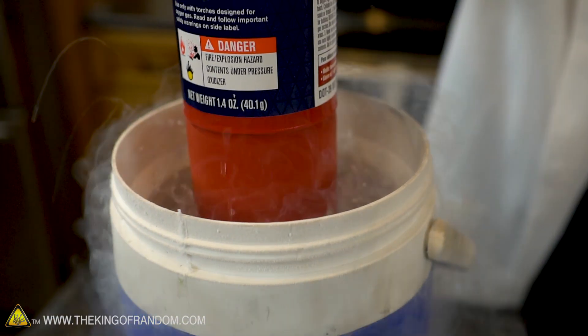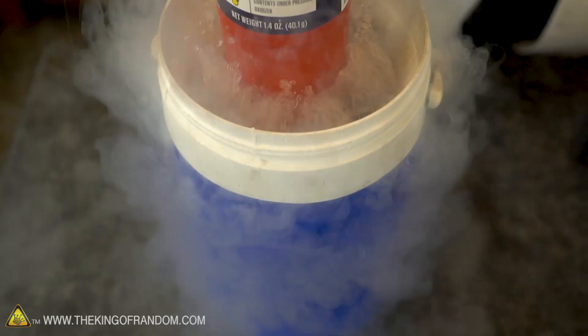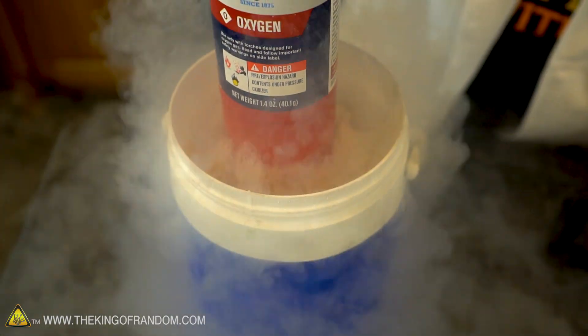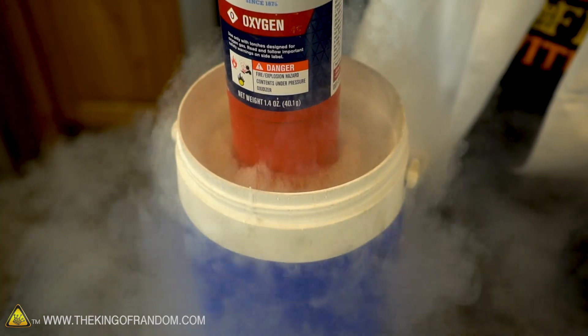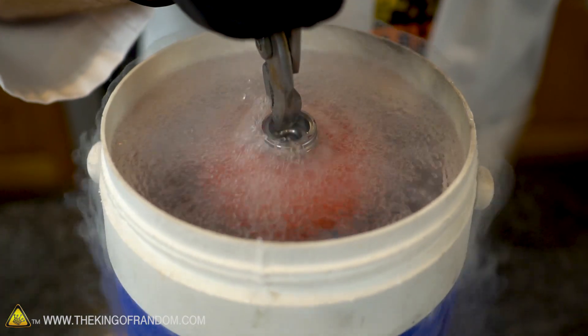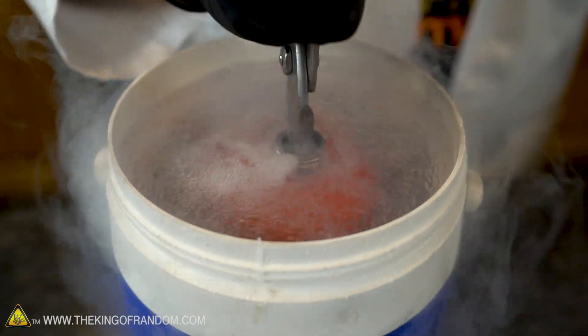I'm listening to the container and I can hear things contracting in there. I can hear it cooling down. I love these little drops of nitrogen that spit out and leave little smoke trails. We're getting the boil - that's a good sign. The storm before the calm. And we just hit the bottom - that's as far down as I can go.